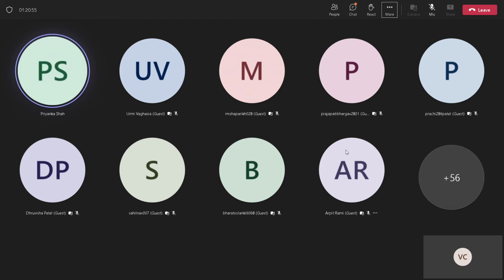Another question could be: why does ninhydrin give a color with the amino acid complex? Because with the alpha amino groups, it will form a complex that gives Ruhemann's purple color, right? And what other question could there be? Yes, what is the equation for the retardation factor? Okay.